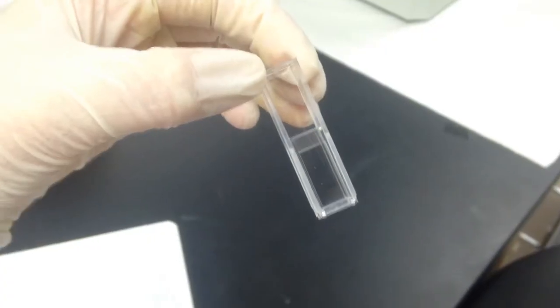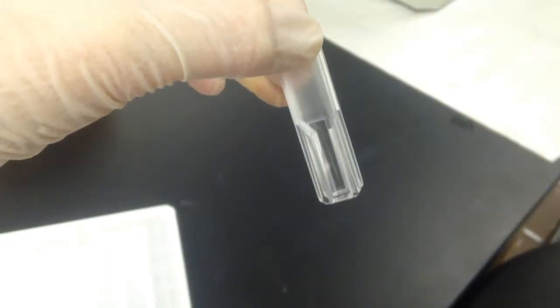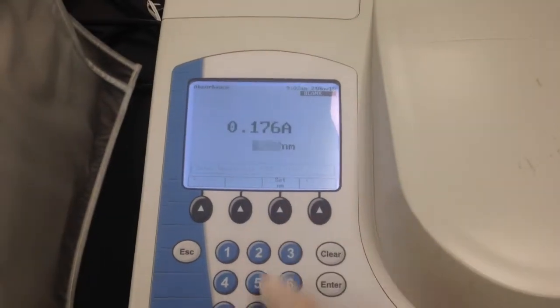Since the machine is used to measure the absorbance of larger sample volumes, we will be using a cuvette. Begin by setting the machine to the desired wavelength.